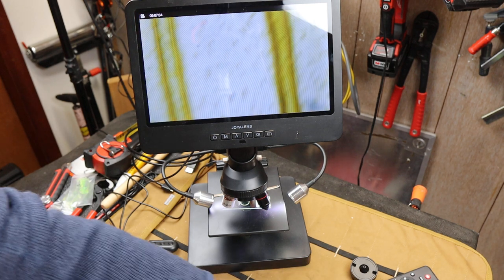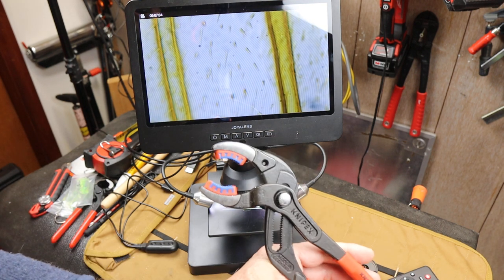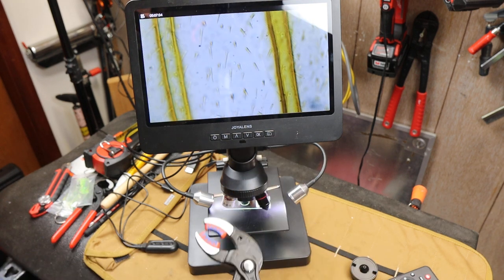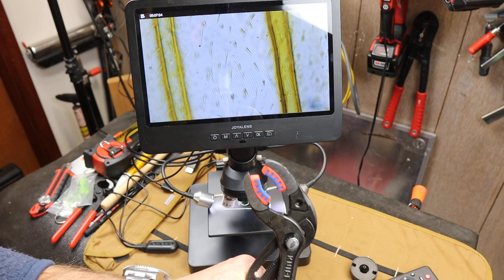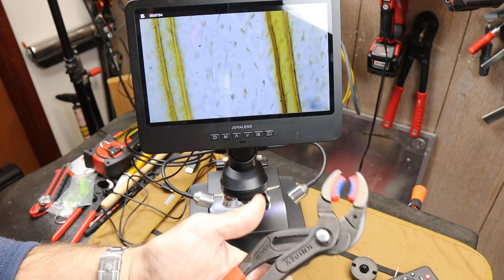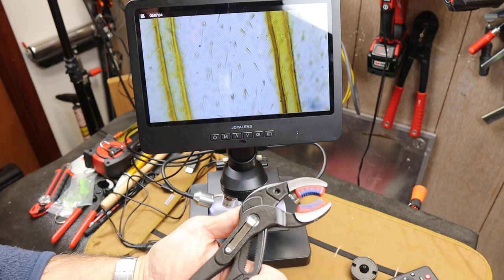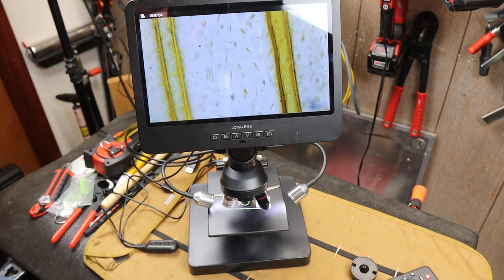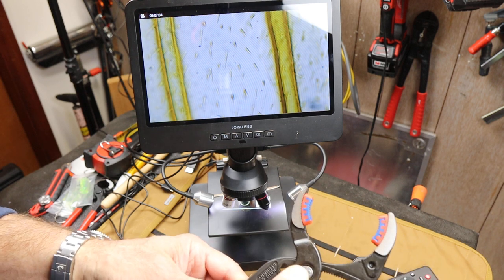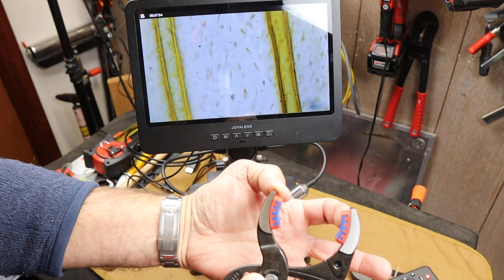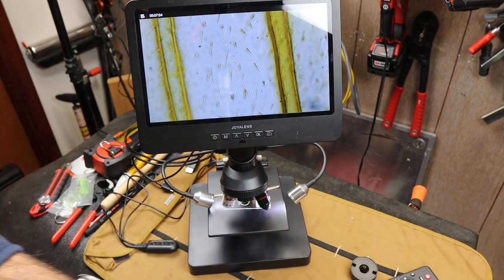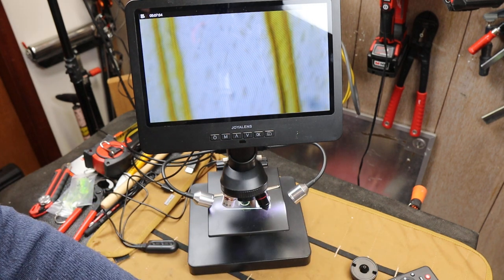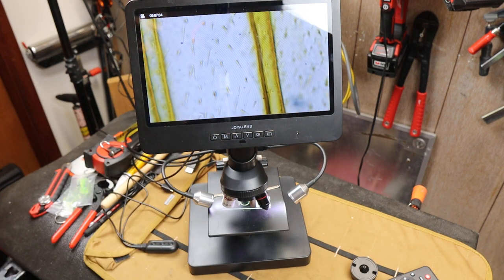By the way, here's my tool. I used these in order to get that objective out of my other microscope, because I hadn't taken it out in decades. So these actually work great for that. Which there are lens pliers designed to hold glass lenses when you're working with different kinds of optics.